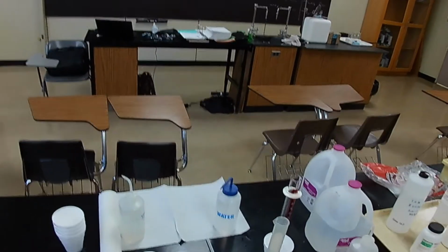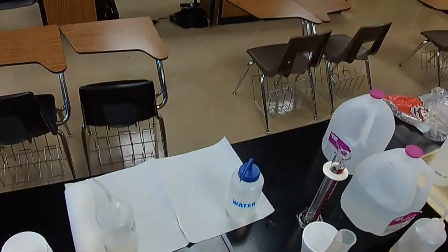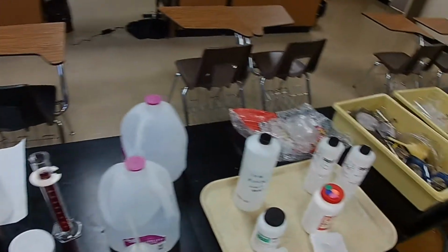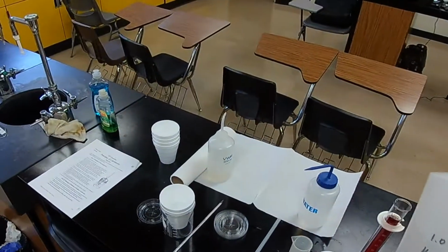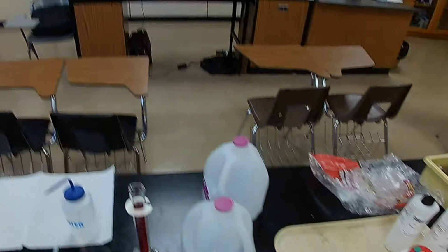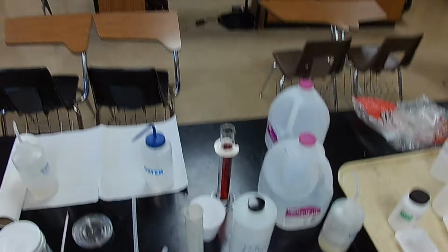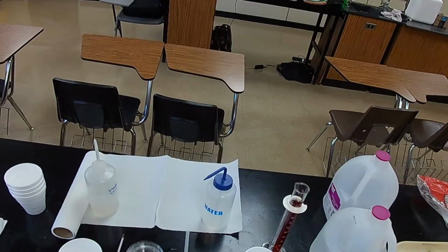But did we match the volumes exactly? No. We put 60 milliliters of sulfuric acid in here, and we're going to put 50 milliliters of 1 molar, well, not sodium hydroxide, pardon me, potassium hydroxide. That's one of the changes in the method. The method calls for sodium hydroxide. We're using potassium hydroxide. Works exactly the same. But why do we use 50 milliliters of potassium hydroxide and 60 milliliters of sulfuric acid? It's simple.